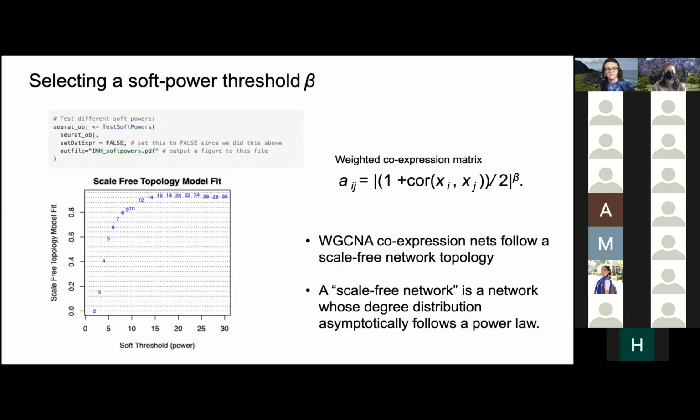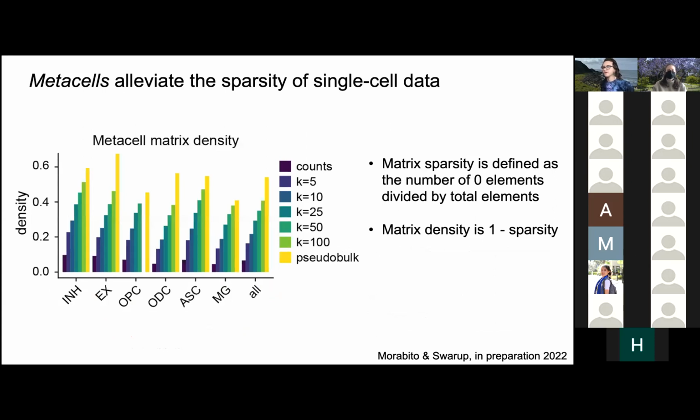And then there's one more question in the chat. Andrew's asking if this plot is easy to make as part of scWGCNA, or if you'd have to write custom code for it. Okay, I have the code. I was planning to include this plot in the scWGCNA paper, but it's actually not currently on the website. But I can definitely add it if this looks interesting. I think it would be useful.